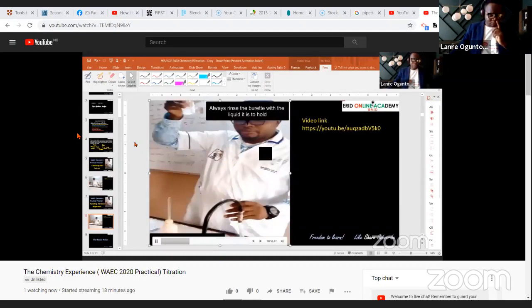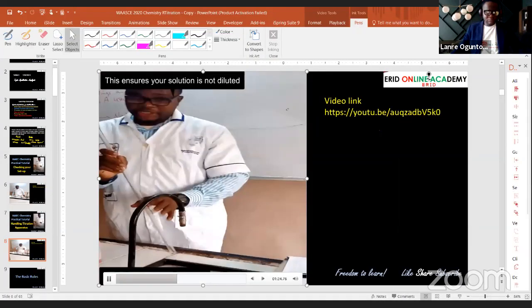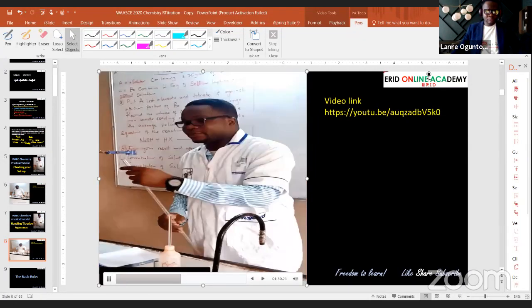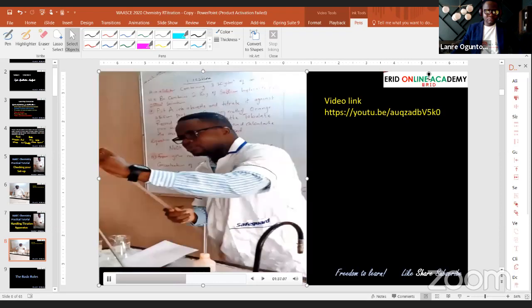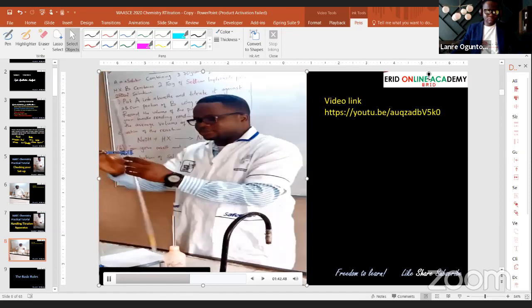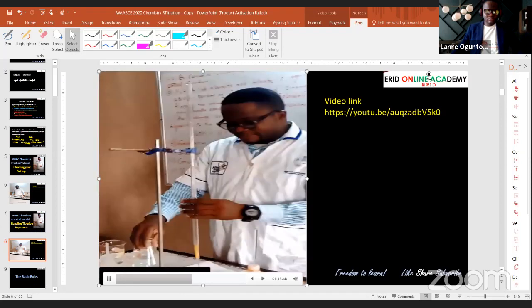Okay, and the reason we are doing that is not to over dilute the solution. Okay, that's the reason, so that you will not over dilute your solution. Under your question 3, they ask questions on the management of apparatus. So that's the reason why you rinse your burette with the acid, because the acid is the solution that the burette will have to hold. Okay, so that's it.